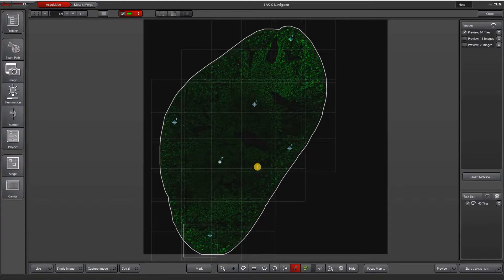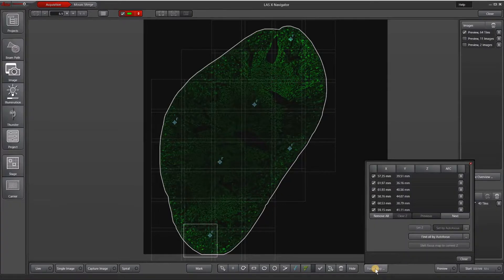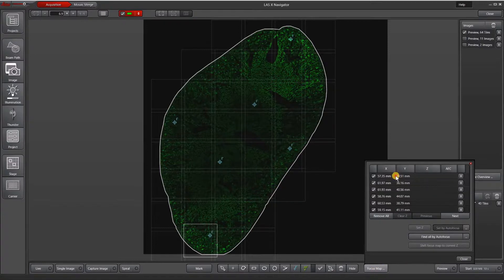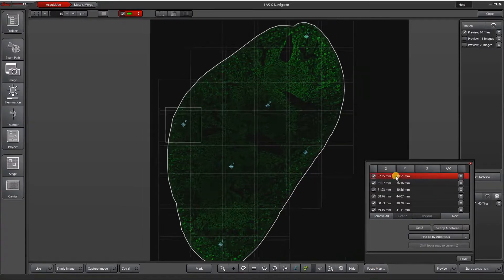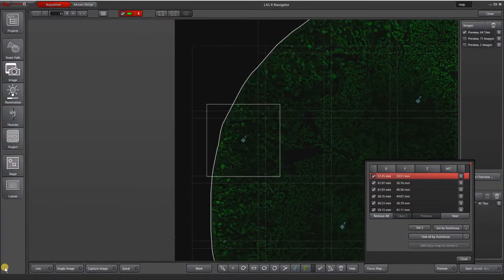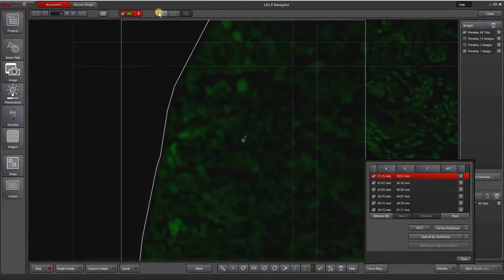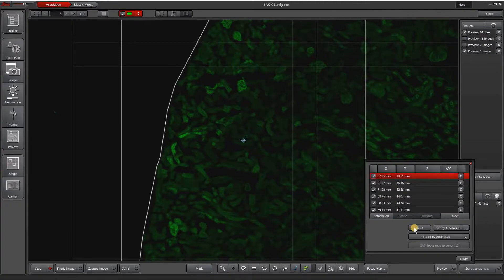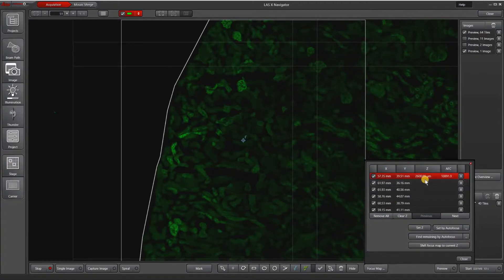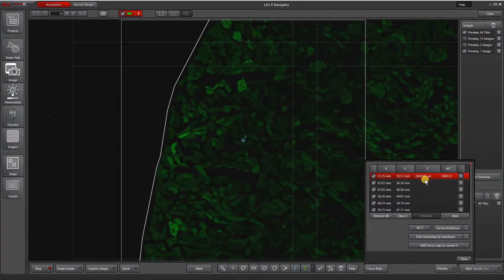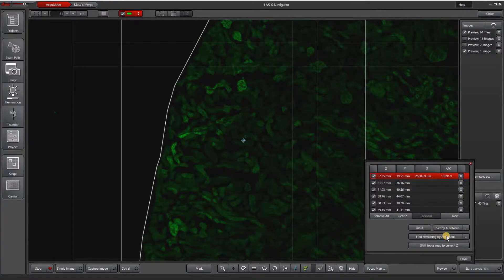When I'm done selecting focus map points, I hit this focus map button on the bottom right and it brings up all of my focus map points. If I select the first one, it will go there and then I can click live and focus here. When I'm happy with the focus, I will hit set Z. It puts in a Z for the focus and then I can either manually go to each point and set the Z or I could find remaining by autofocus, which is what I'm going to do.